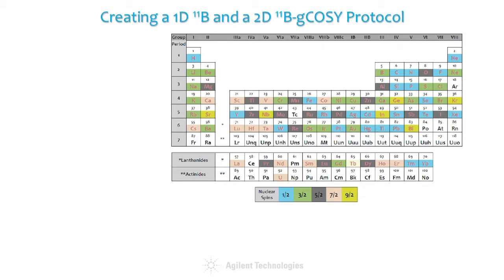One of the strengths of NMR spectroscopy is the wide variety of nuclei it is capable of detecting. A quick look at the periodic table reveals that almost every element has at least one NMR active isotope. The vast majority of NMR applications concentrate on elements frequently occurring in organic or biomolecules, such as proton, carbon, and phosphorus. In inorganic chemistry, problems are often associated with other members of the periodic table.